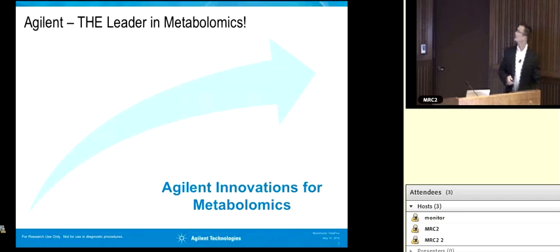One of the examples that Gary Patti actually showed yesterday, and I'm just delighted that our data actually matches what his said, because that would be really embarrassing if it didn't. We're going to talk a little bit later in a data set about the TCA cycle and following the flux pathways through. In many cases, we see glutamate would enter the TCA cycle, and it would do so in a clockwise fashion. In certain cancers, in this case, the data we're going to show is in chondrosarcoma, there's actually an alternative pathway that we see from the uptake of glutamate.